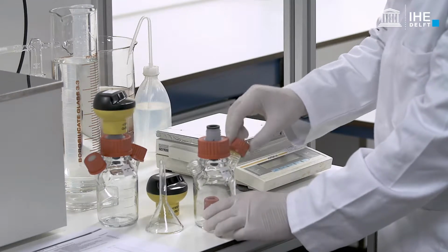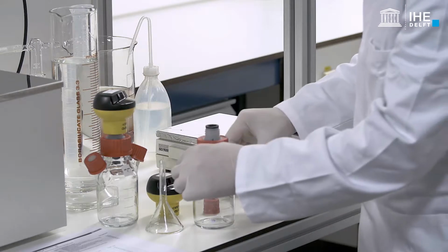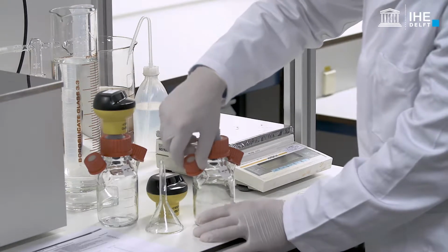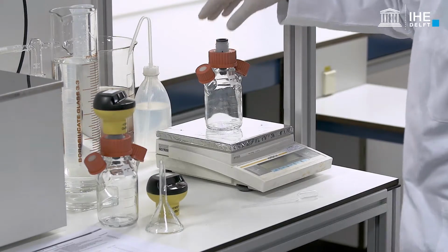First, the reactor needs to be fully assembled. A balance can be used to determine the weight of the empty reactor.